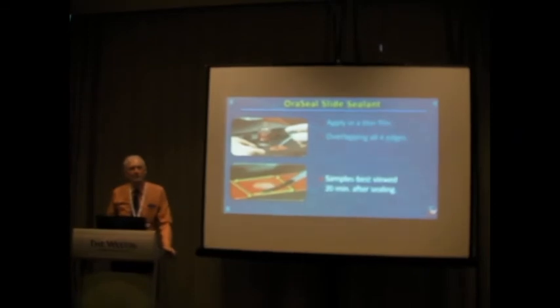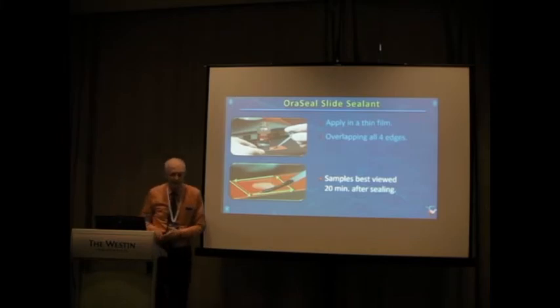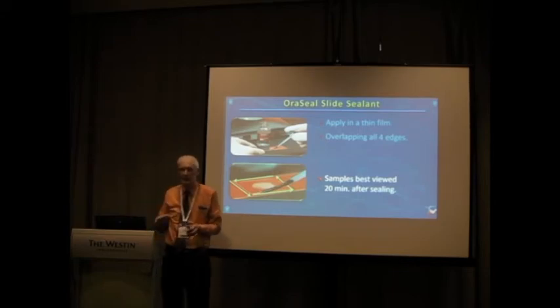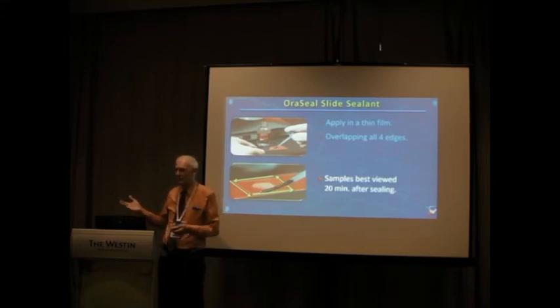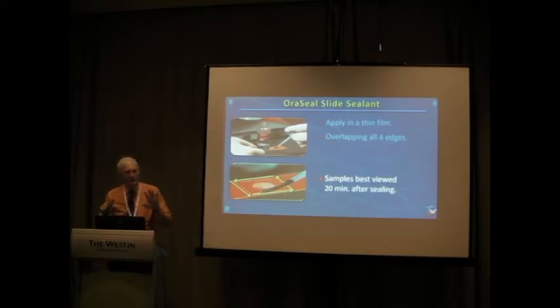It turns out that the best time to look at the samples is about 20 minutes after you've prepared them. That was an accidental discovery. Something about the sampling and preparation process seems to inhibit the bugs. You can look at a fresh sample sometimes, and there doesn't seem to be any spirochetes present. And you come back to that slide 20 minutes later, and they're abundant. You know, what happened? Who swapped slides on me? This isn't the one I was looking at. Same slide, but they just come crawling out of the woodwork if you just let them rest for a little period.